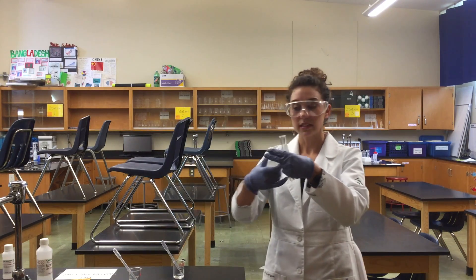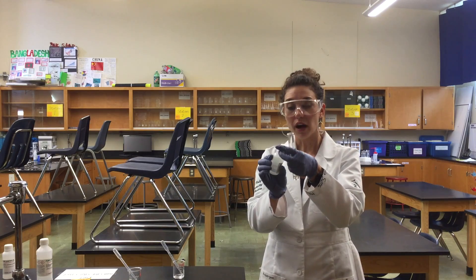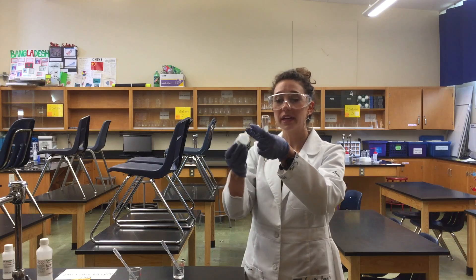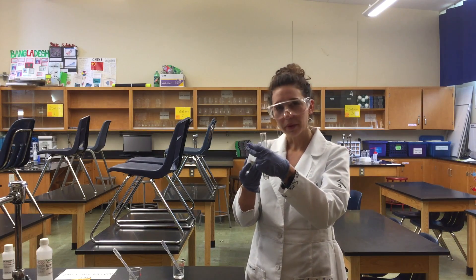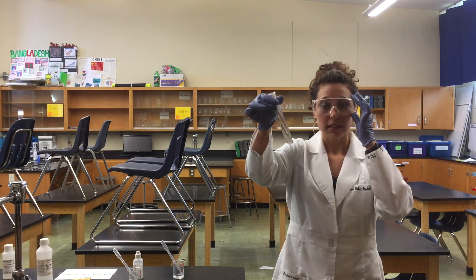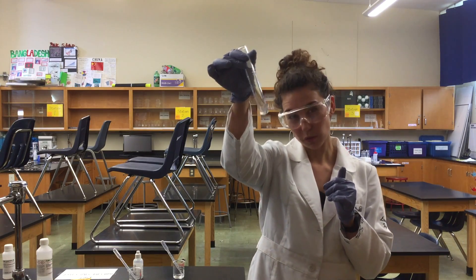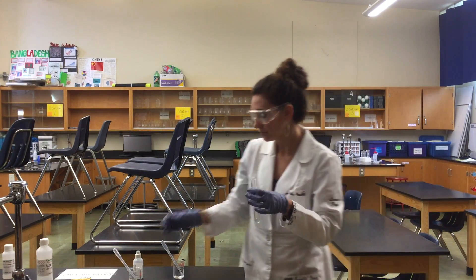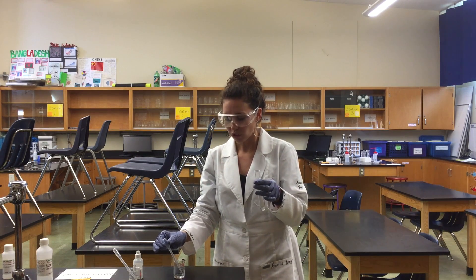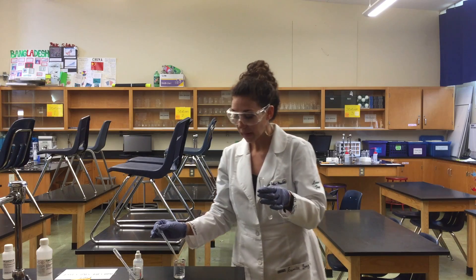To this I'm going to add a drop of phenolphthalein indicator. This is an indicator that will change color based on how much acid or base is present in the solution. This indicator is colorless in acidic solutions, which is why we see no color here. But as it turns to a basic solution, it should turn a bright pink.